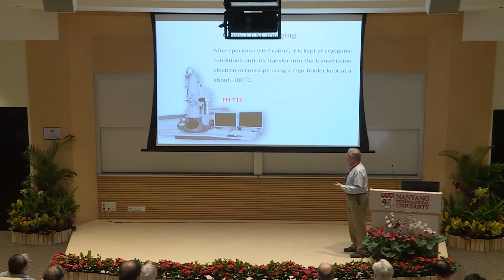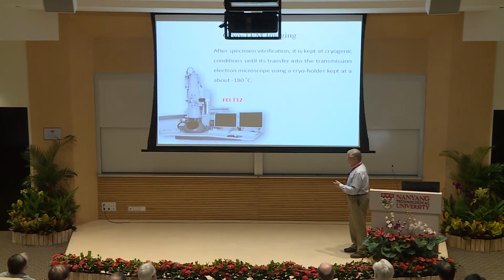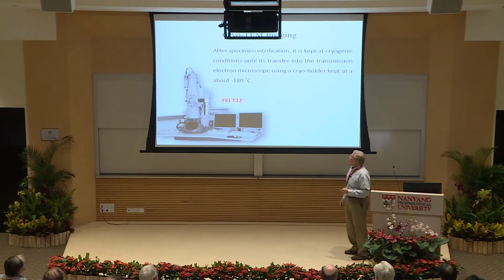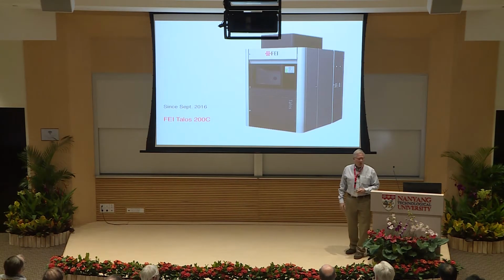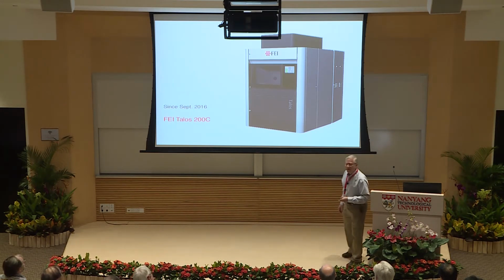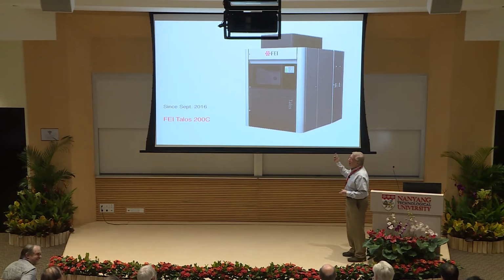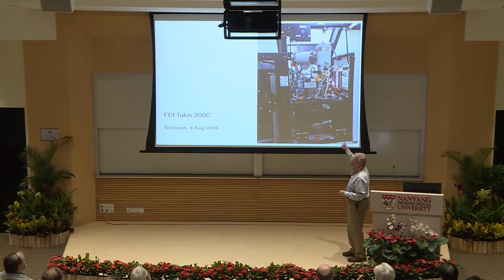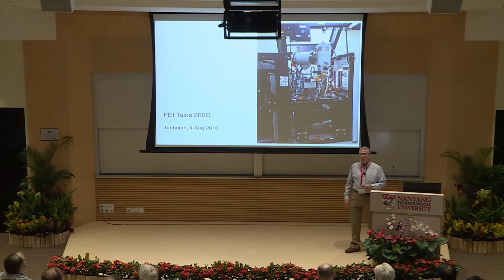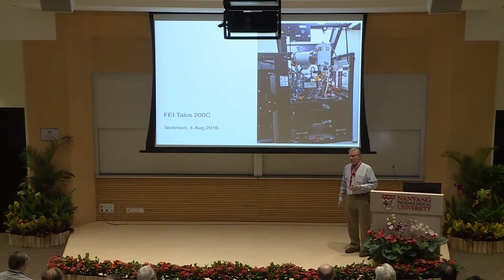Now, this is an old type of microscope, and much of the work that I'm going to describe today was done on the old type microscope. Nowadays, we have moved on, and we have a microscope that looks like this. My students say that it looks like an ATM, but actually you put money in all the time rather than withdraw. This is what's inside the box. It was installed about a year and a half ago, and later on, I will describe some of the very nice features of that microscope.